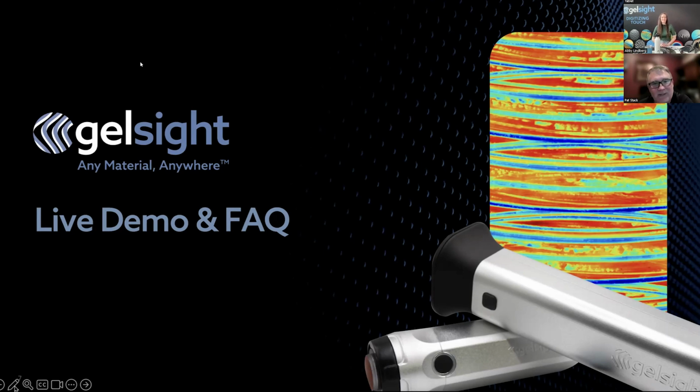Quite often I see that if you don't do leveling or you don't do the polynomial curve to a curved surface, if you're only worried about roughness, those wavelengths end up getting filtered out anyhow. So the form fitting is not quite necessary, but it's in the software. There are certain scenarios where if your part is very out of level, you definitely want to level it before you do the filtering. But if we can measure it, we can analyze it for surface textures.